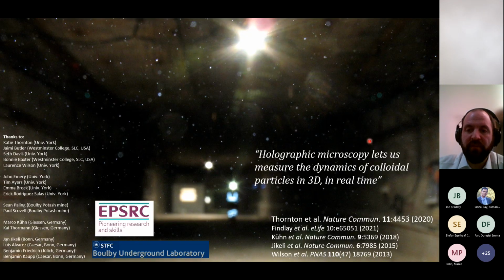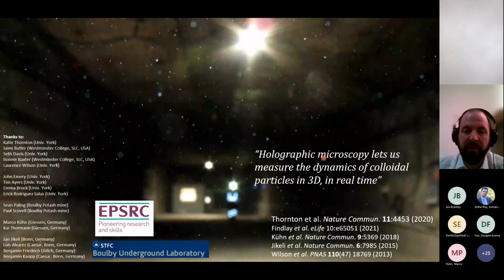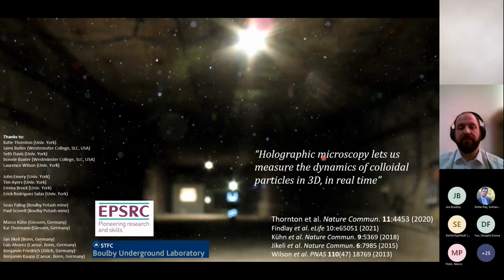So with that, I wanted to leave you with the punchline to say, hopefully we've come in just about on time. The punchline here is that holographic microscopy lets us measure the dynamics of colloidal particles in 3D and in real time. There are a few references just down at the bottom in case you were curious to see more about what we've used this technique for in the past and the kind of apparatus we use to do it. It's very simple.